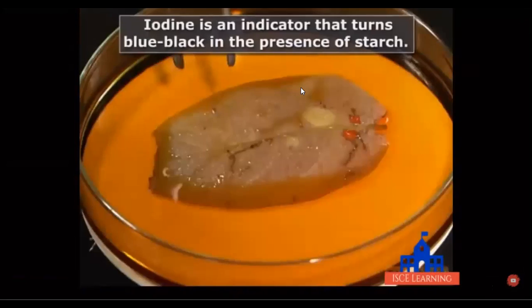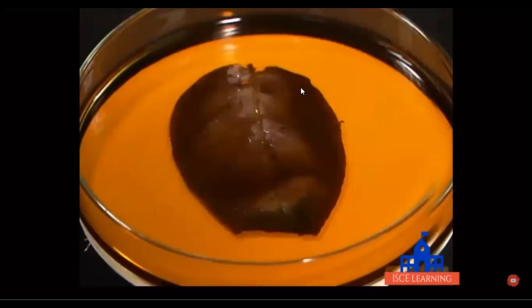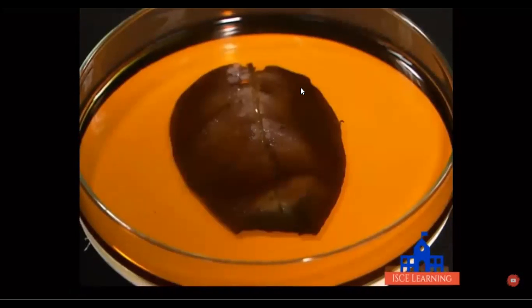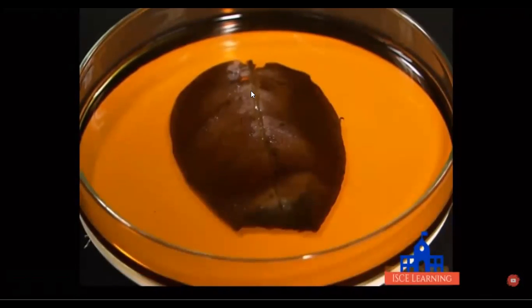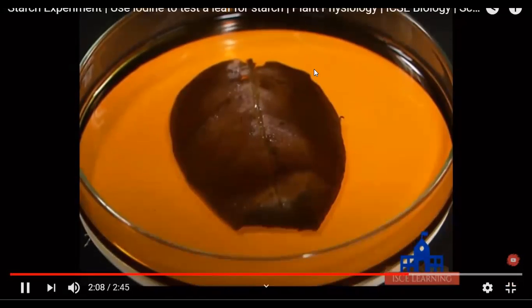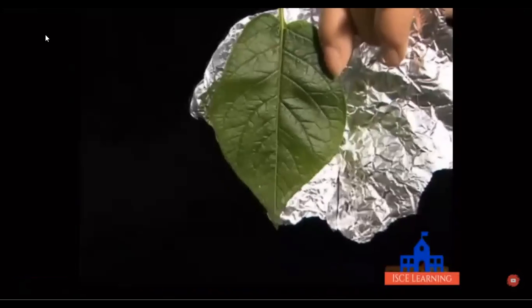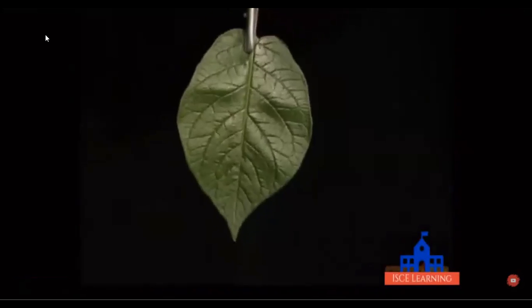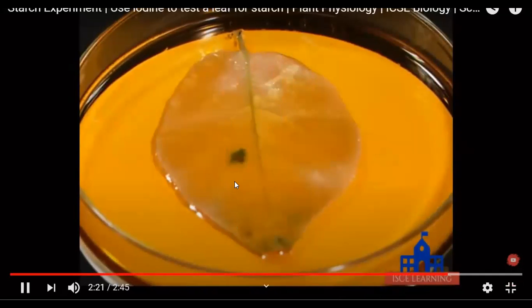The decolorized leaf is then washed in water and dipped into the dilute iodine solution. Presence of starch can be detected visually by change in the leaf color. Leaf exposed to sunlight turns blue-black or bluish-purple in color, which demonstrates that photosynthesis was going on in the leaf, therefore producing starch. On the other hand, the leaf that was covered does not show any change in color much evidently, and hence gives brown color with iodine.